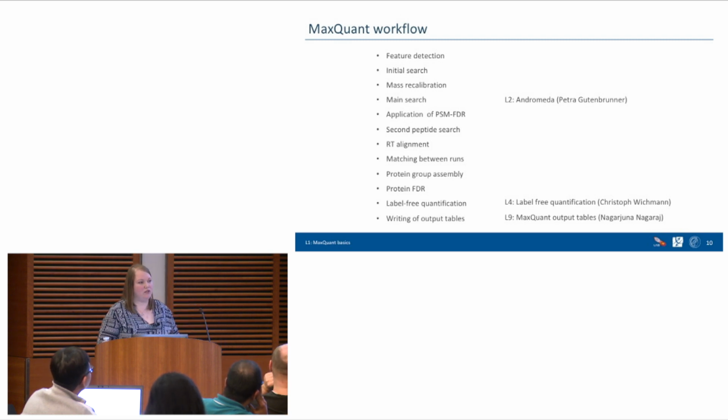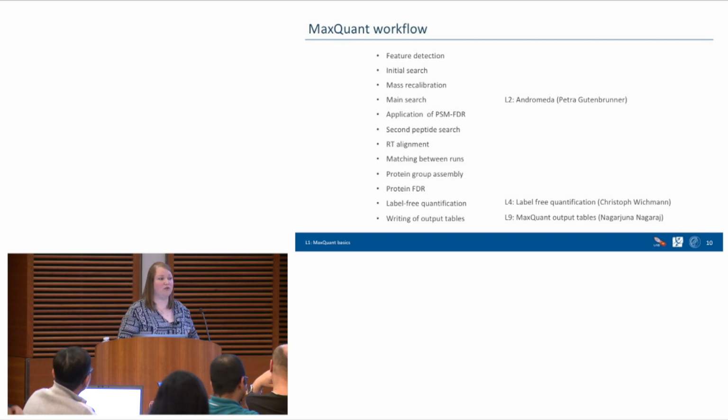So now let's go into those workflows. Also, what I wanted to mention here is that those are not all the workflow steps that are implemented in MaxQuant, only the main important ones that we can focus on.